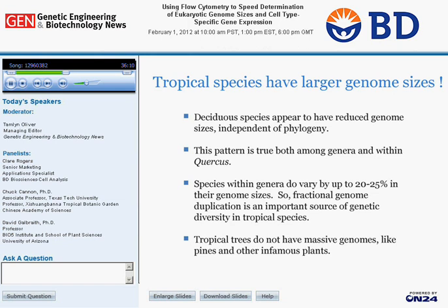So tropical species do seem to have larger genome sizes, and even though it's hard to determine the direction of the evolution from the phylogeny, because it's still a relatively simple phylogeny and you don't have a lot of shifts between the temperate and tropic zone, you only have a couple of examples. So it's a little bit hard to tell the direction of the evolution, but it seems, particularly looking at the Quercus example, if you remember, the Cyclobalanopsis was basal in the genus, and that was larger. It seems that the deciduous or the temperate species have reduced genome sizes, so it seems that genome sizes are getting smaller as things diversify in the temperate zone. And this is relatively inconclusive, but that seems to be the pattern.